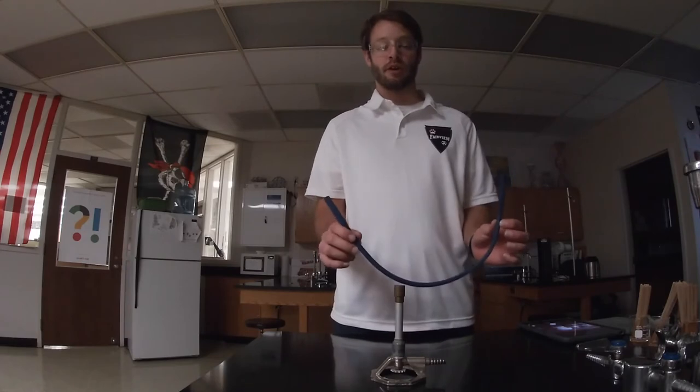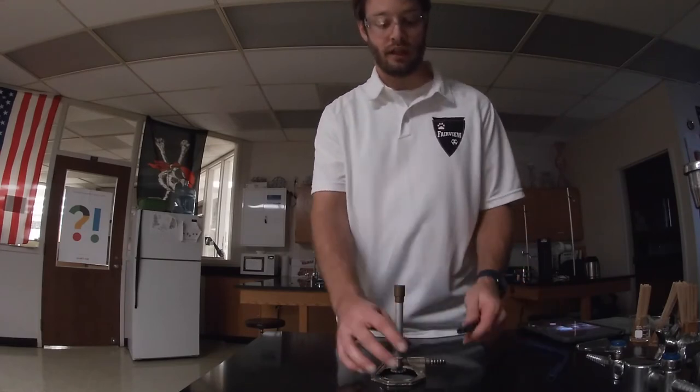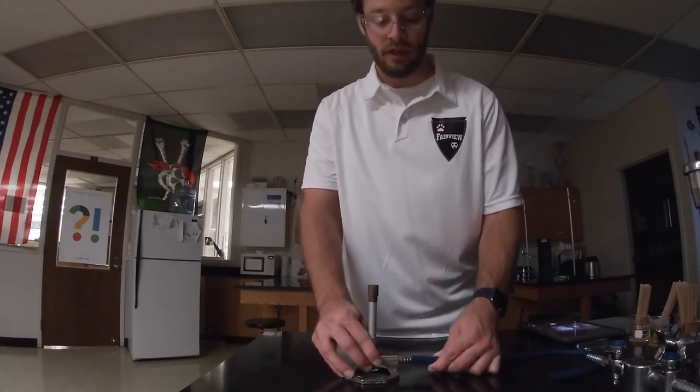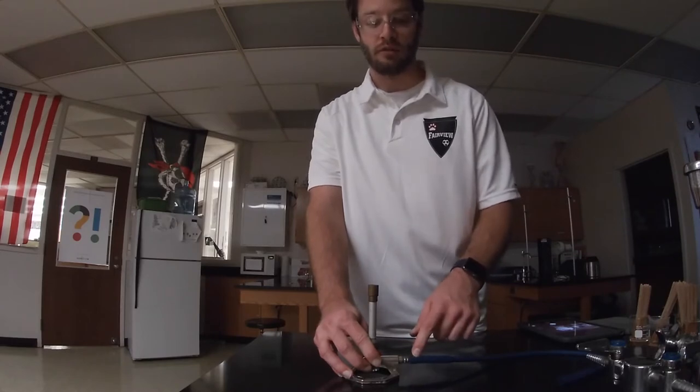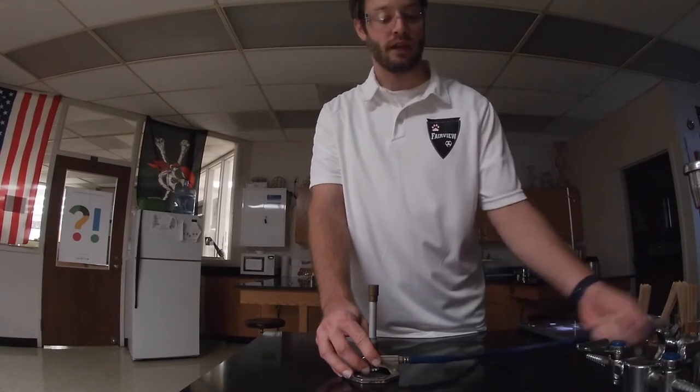To hook up the burner, you need a hose that pushes onto the inlet. Push it so that it fits over a few ribs — you don't want to push it too tightly because that could split the hose. You just want to make sure it's a good seal, and do the same thing for the gas jet.